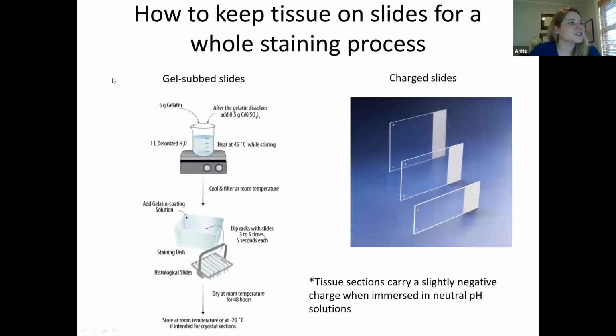So then I just wanted to give a couple comments on equipment in the lab. So, how to keep tissues on your slide for a 2-3 day staining process. And I'll just tell you a little story about my first job in a lab when I was 20 years old at the University of South Carolina. I got to gel sub slides. That was my job. It was terrible. So don't forget that you should just buy charged slides, because gel subbing slides takes you 2 days.